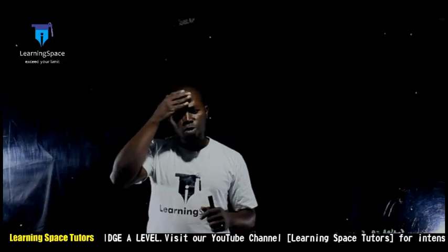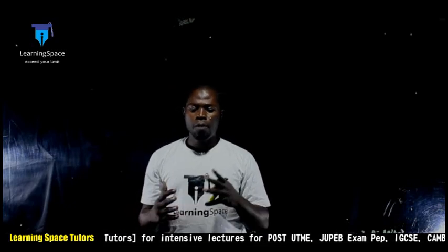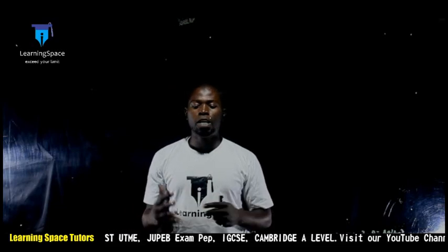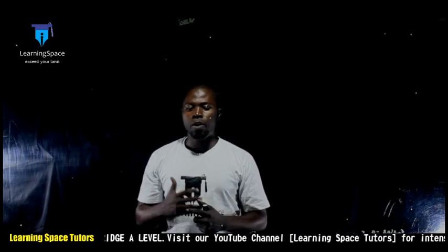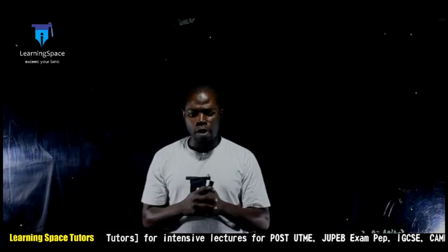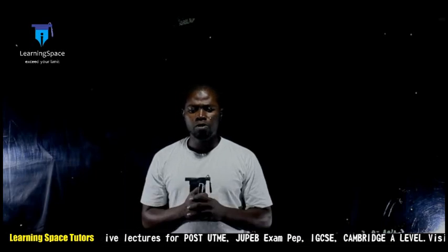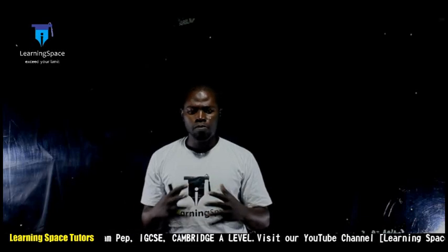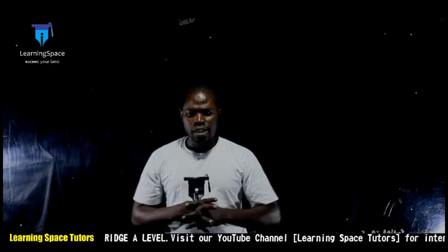Today, I'm going to take you through the rudiments in answering chemistry practical questions, especially in volumetric analysis and qualitative analysis when it comes to exams like WAEC, NECO, and the likes of the O-level exams. So I will take you through revision questions, and these revision questions will enable you to be able to tackle problems when it comes to the examinations.